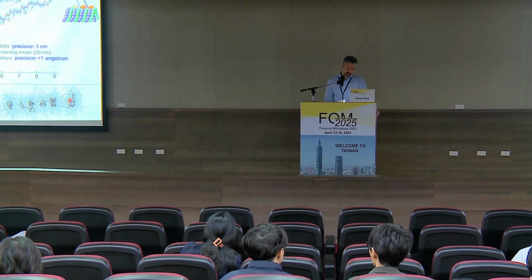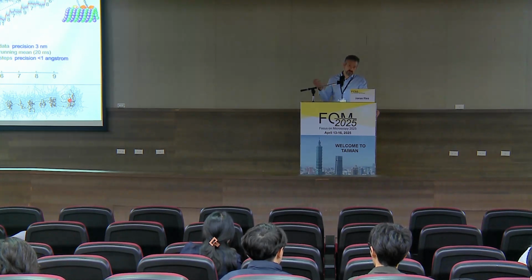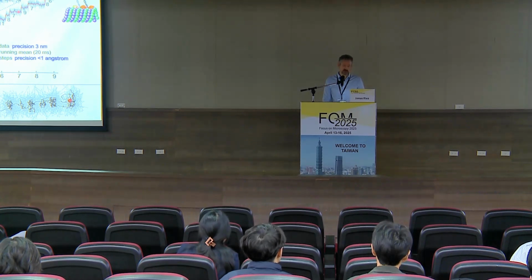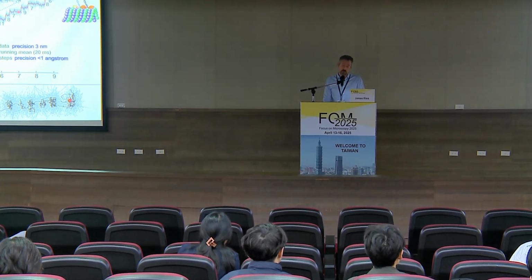Yes. If you look at the gray one, I think it's mostly shot noise, mostly the limited resolution from the number of photons that we detect. So you get this kind of noise. In addition, you see something that looks a bit more systematic like this, or sometimes we see this overshooting here. Again, we could or should use our simulator to see if this could be an artifact from the MINFLUX itself. I'm not sure about this.